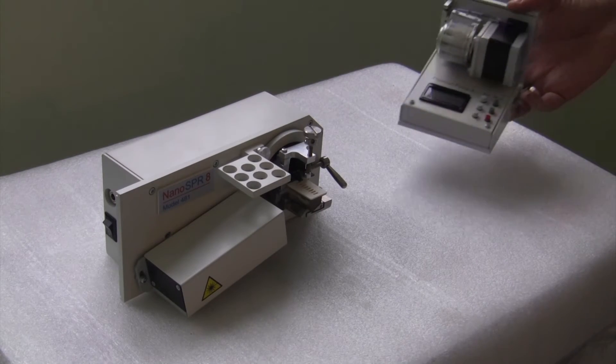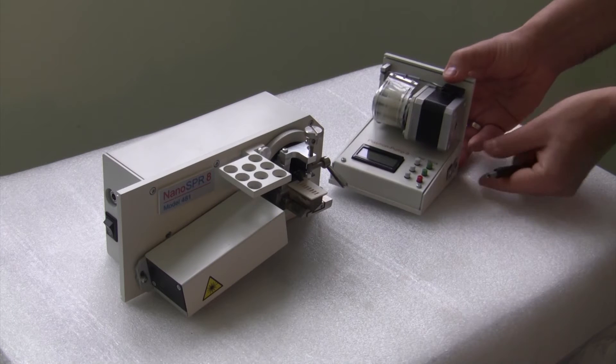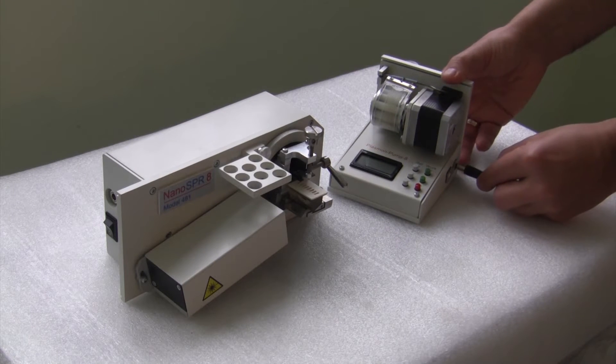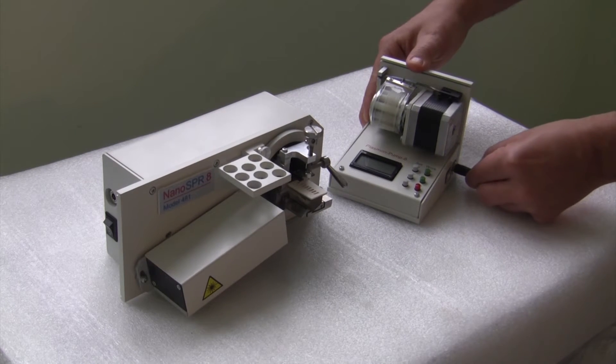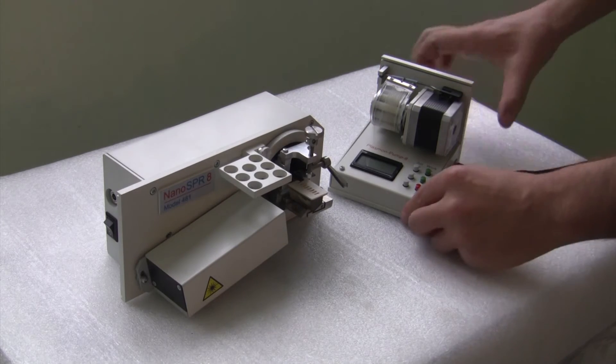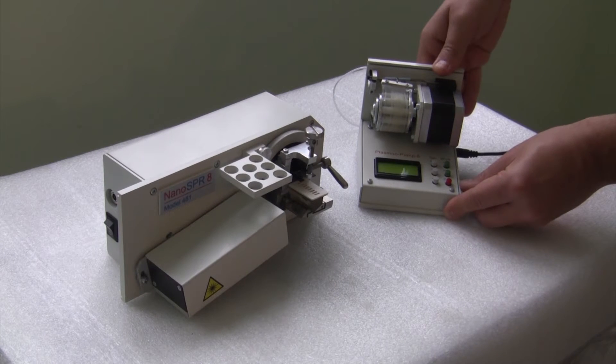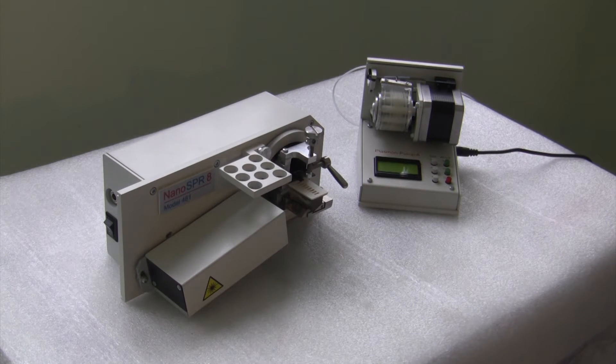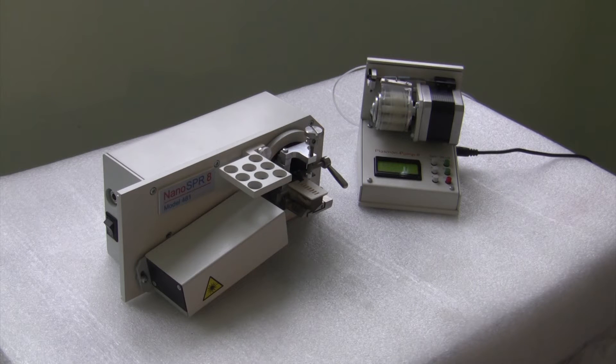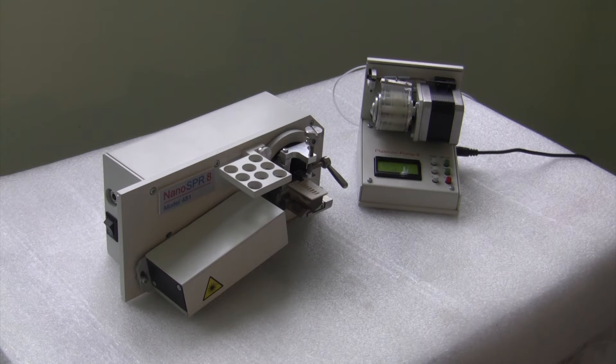Our SPR devices require a peristatic pump if you plan to run liquid flow mode experiments. We offer a peristatic pump that is integrated with the device software via USB connection. User can adjust flow rate, direction and start-stop the pump manually by using buttons at the front side.